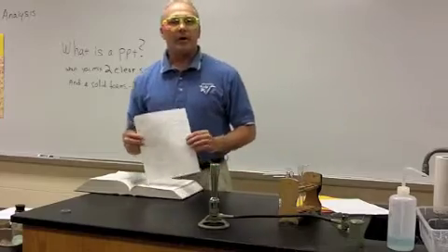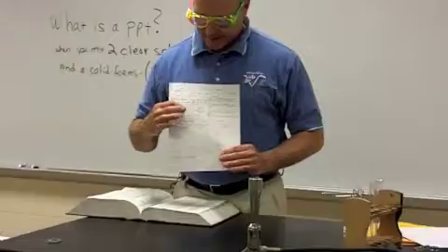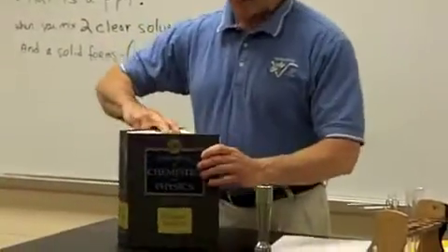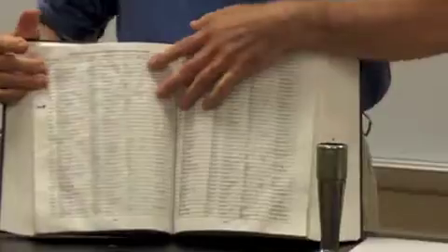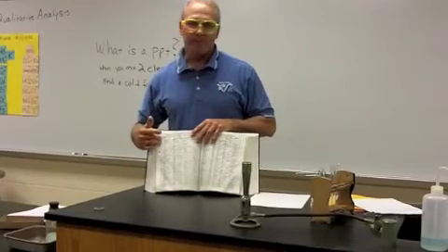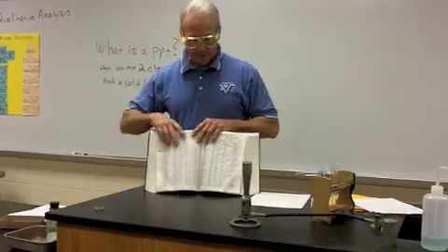Okay, you have completed all 7 tests, and here's what your data table looks like. You have your 7 preliminary tests, you have your confirmatory test. There is one more test that you have to do or check, and it's called the handbook check. What you will do is take the Handbook of Chemistry and Physics, these will be in the lab for you, and you open up to the inorganic compounds. And you'll have a close-up of this and what this looks like, and the information will be listed. It's alphabetically listed. We think we have iron 3 nitrate, so you go under iron. And once you look under iron, you go alphabetically, find the nitrate, and you read across the information.